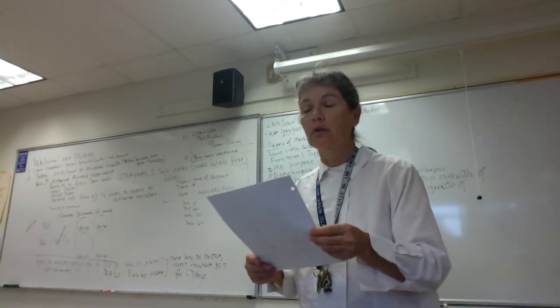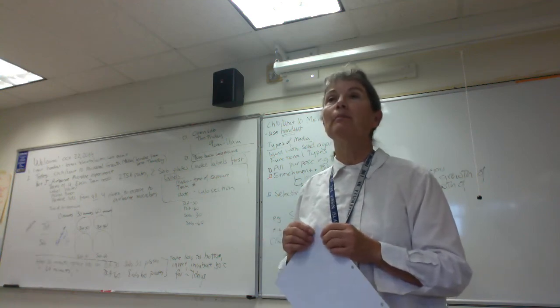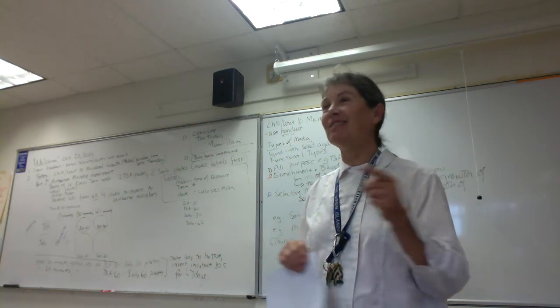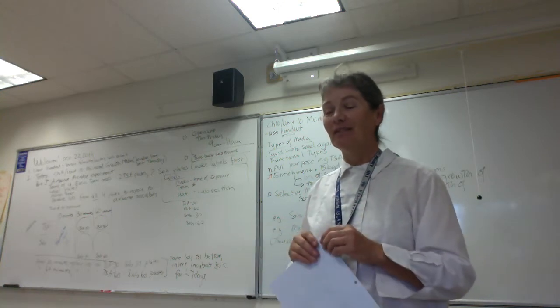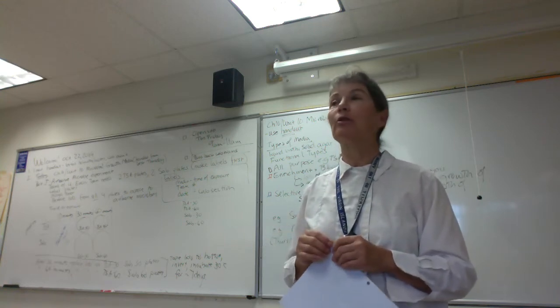All right, folks, so first of all, let's just ask ourselves, what do we mean by medium or media? So it's just food for our microbes. Medium, singular, media is plural. I'll never mark you off if you get singular and plural mixed up on an exam. Right, so it's food for our microbes, because very often in our microbiology lab, we're trying to get our microbes to grow, to replicate.